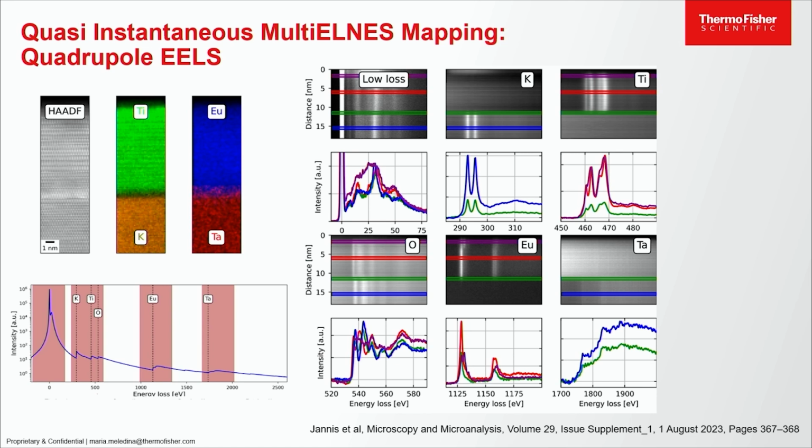We were also running some real samples with it, not only DSO, with our collaborators at IMAT, and they were looking at some films grown on top of each other, and they were wondering about the chemistry. They were doing quadruple EELS, so 4 energy ranges, so that's the simulation. And here is the practical real data. And it all looks very good.